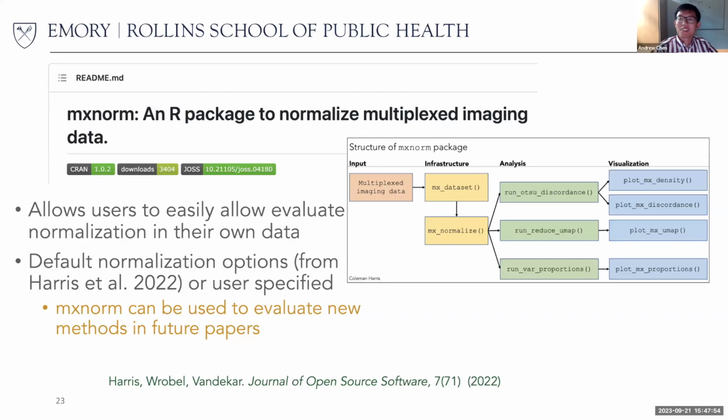Sorry to interrupt, but just to clarify, you basically have features measured on a cell level, right? So after segmentation, each cell has a certain intensity. Okay, got you. I was wondering too, the slide has background where there wouldn't be expected to be any cells. Are those different between slides as well?